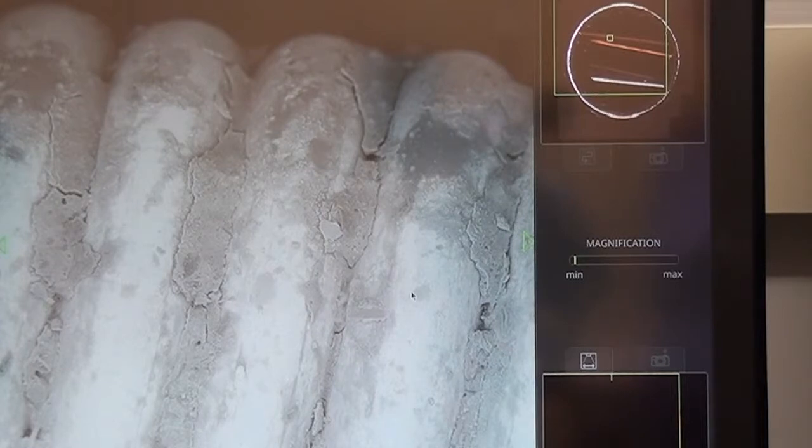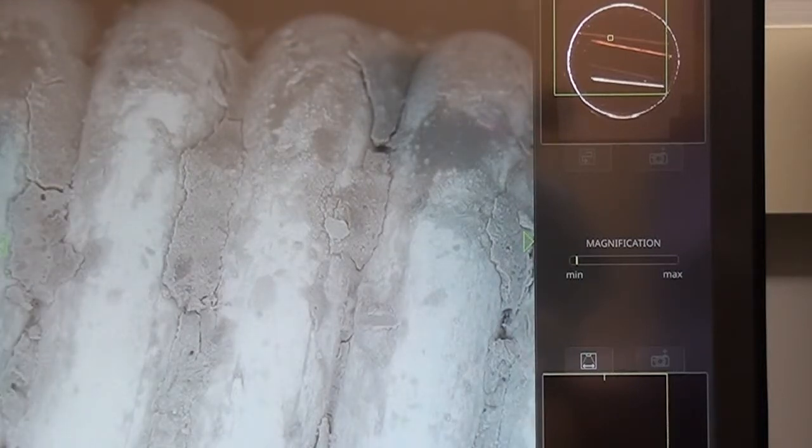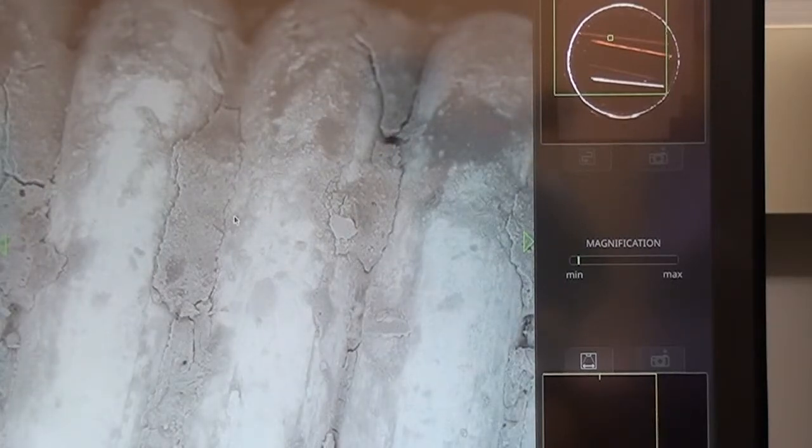Also one more thing, the copper wire is metal and so it is a solid malleable ductile substance. Whereas if you have an oxide, for example copper oxide, that is an ionic compound and it will be crystalline and hence brittle, which we can see it like over here. And that is why the substance breaks once it gets oxidized.